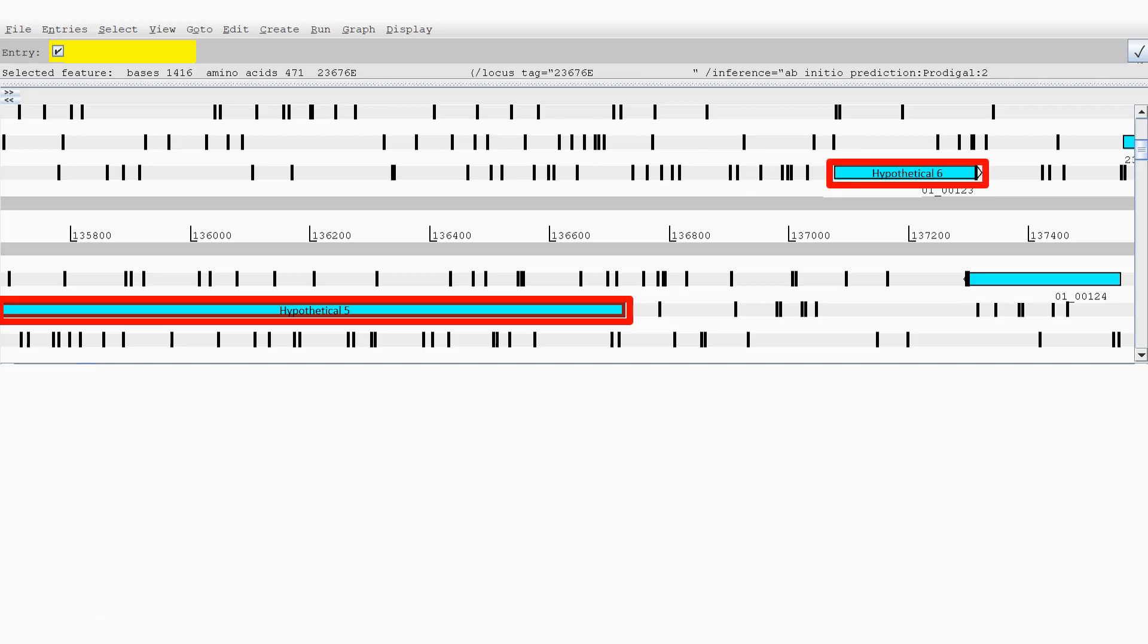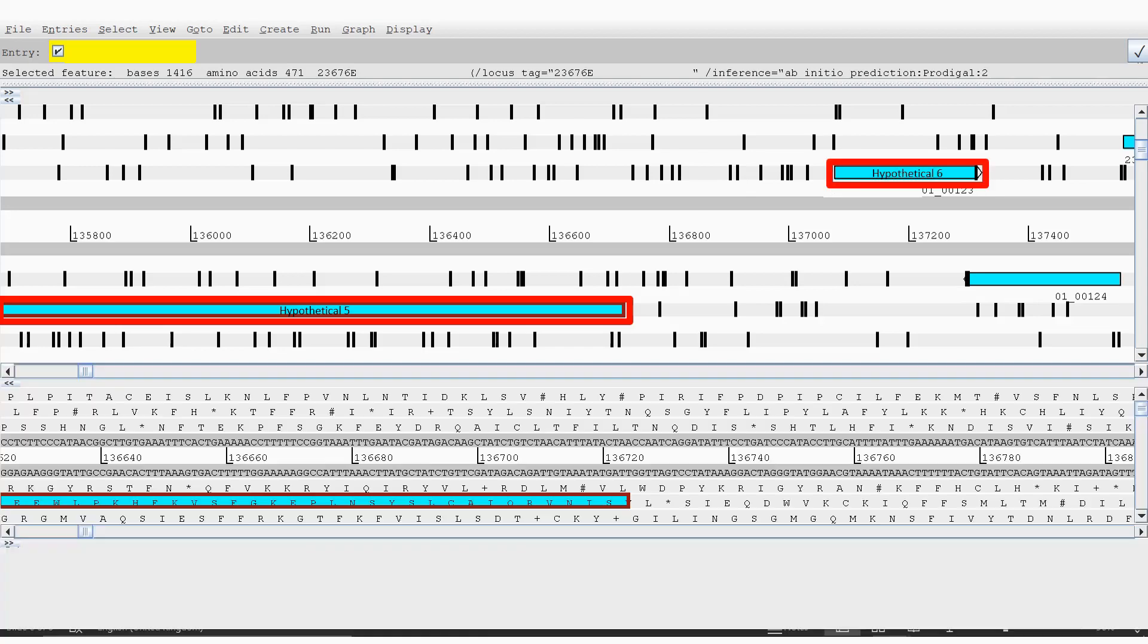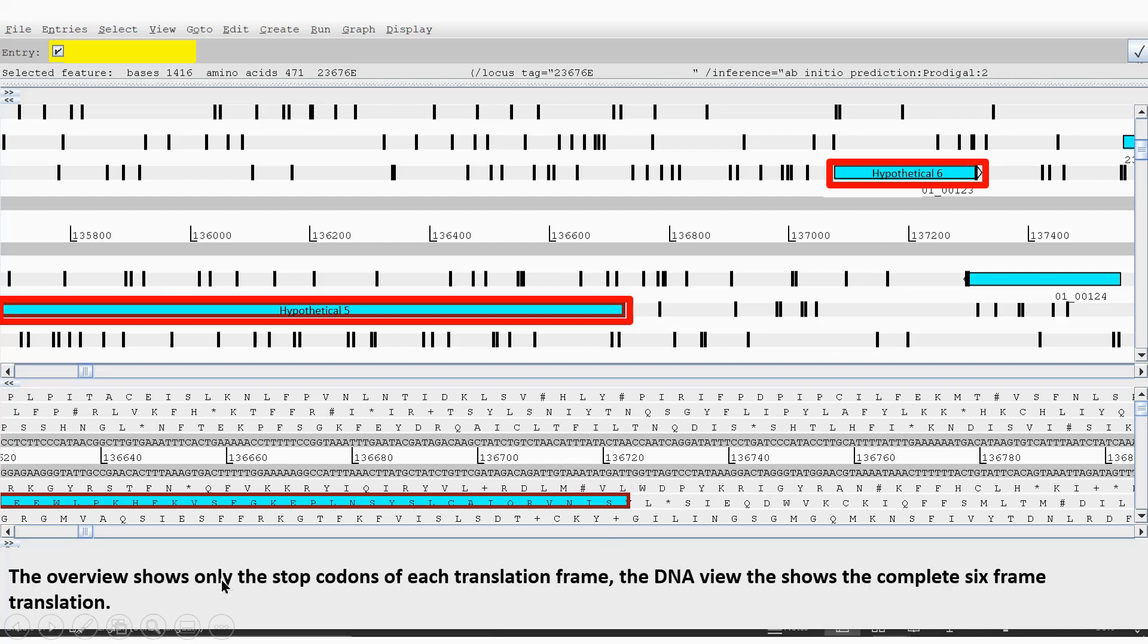So in addition to these tracks in Artemis, you can actually get down here the six-frame translation, as well as the nucleotide sequence along here. And hypothetical gene five, you can see the overview, as I said, only shows the stop codons in this, but you can actually get the start codons up as well.